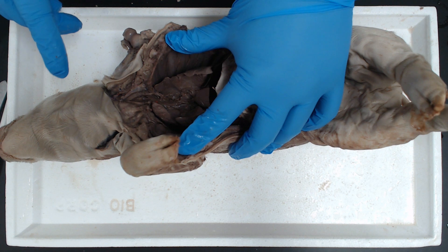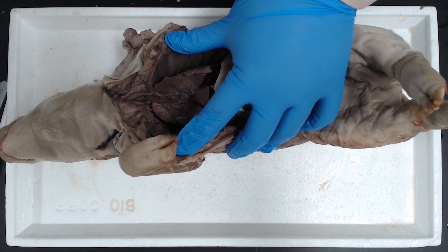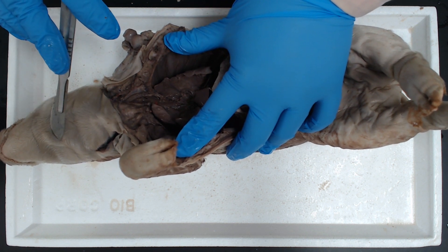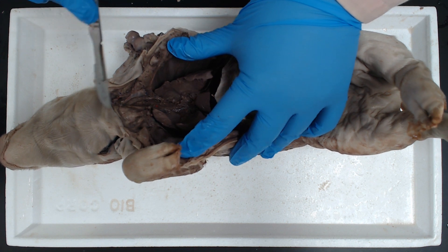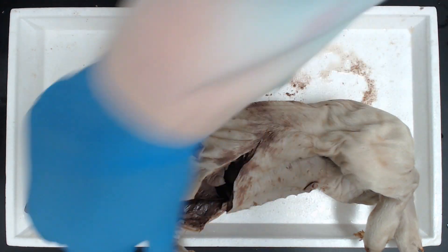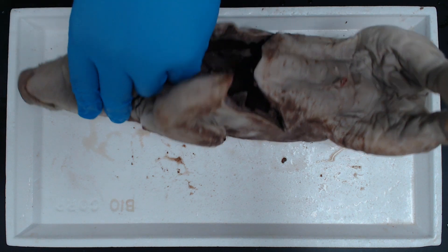What we're going to do now is try to remove the respiratory system. We want to see the epiglottis, the larynx, the trachea, the lungs, and the bronchial tree. One big issue we have here is that all these muscles within the jaw are really tight and preventing us from seeing the epiglottis.